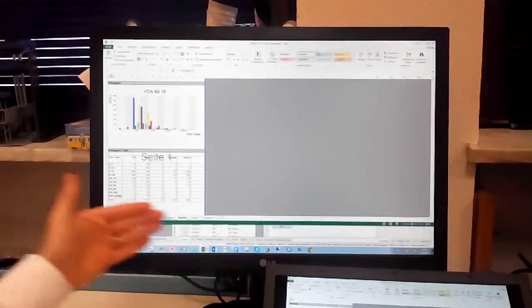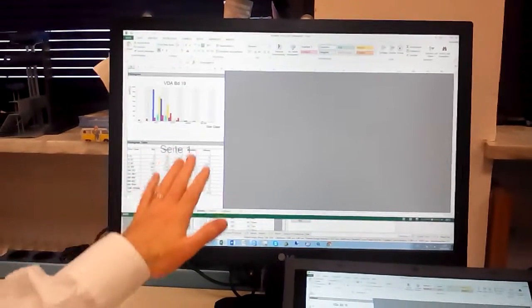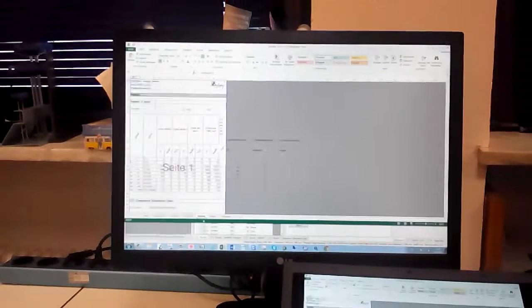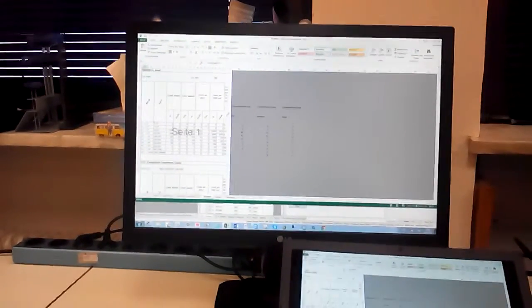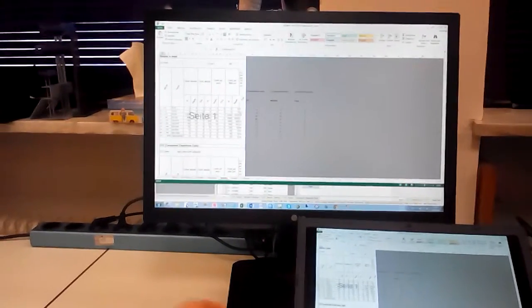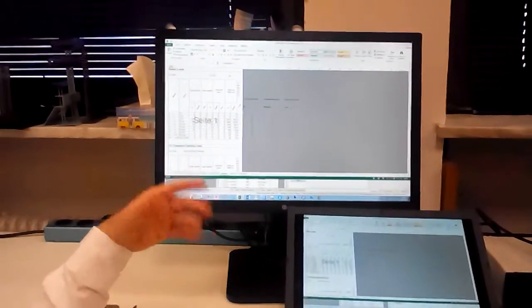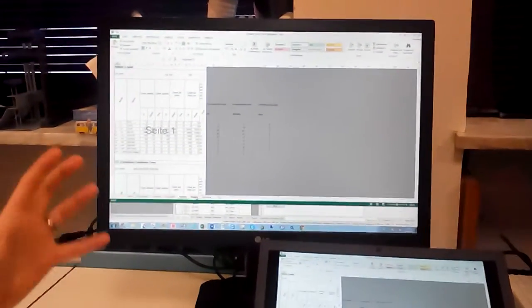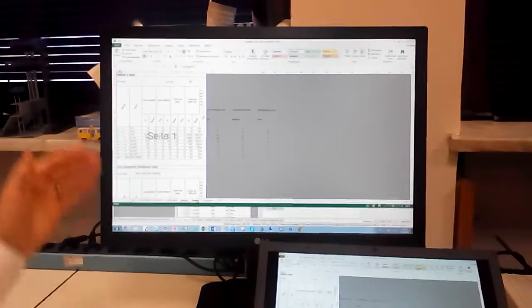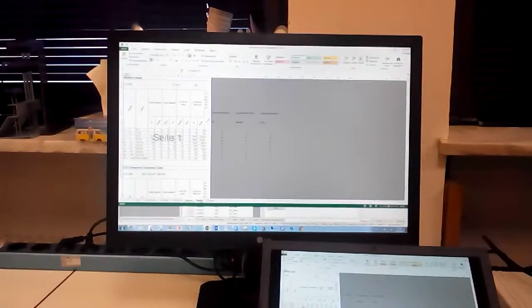So it's giving us that complete class list of all of those particles and how they're broken down into fibers, metallics, etc. That's a more statistical view. Inside some of these specifications, like ISO 16232 and VDA BD19, you'll know that there are much more detailed requirements, and I mentioned that the system is fully compliant with those. So this particular report gives us a lot more detail about those too.